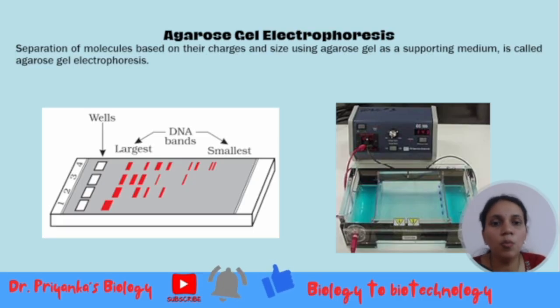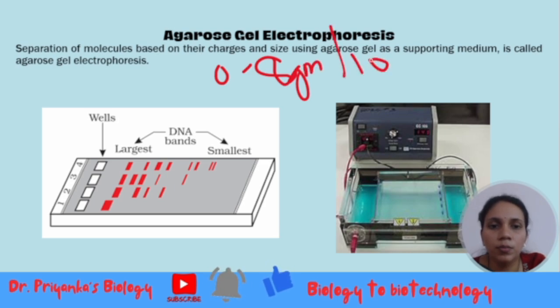So if you put more agarose, for example, if we are using 0.8% agarose, 0.8% agarose will contain 0.8 grams of agarose, which we will add to 100 ml of water. Sometimes it is made in buffer, sometimes it is made in distilled water. So we are going to weigh 0.8 grams and transfer it into the water, shake and boil it, right?